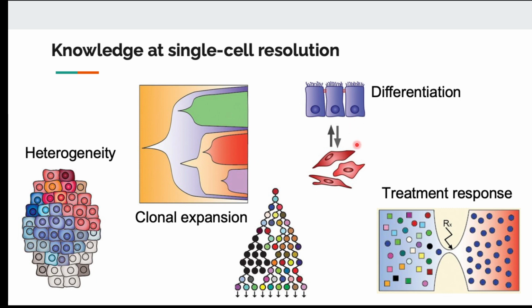When you want to study a stem cell system, where some cells differentiate and some cells remain stem cells, you want to understand the composition, and you want to see the transcriptomic change that occurs between stem cells and differentiated cells. In this case, you need to have transcriptomics data at the individual cell level in order to compare the genes that are upregulated or downregulated during differentiation.